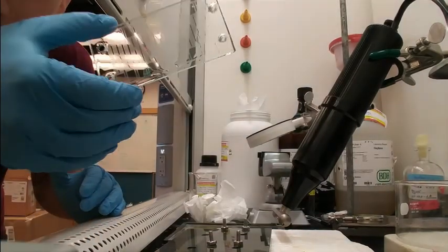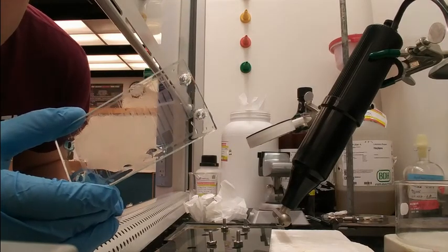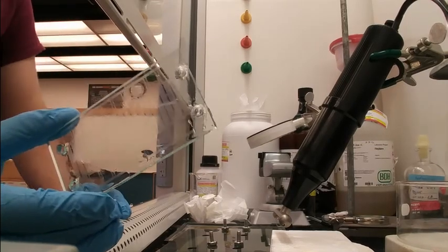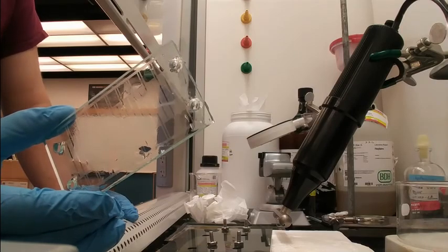First, we clean our FTO glass by sonicating in acetone for 5 minutes, in methanol for 5 minutes, and then in water for 5 minutes. We store it in Milli-Q water until just before using it, and then we use a nitrogen gun to dry all the water off of the chips. It is very important to dry all the water to ensure maximum bonding to PDMS.